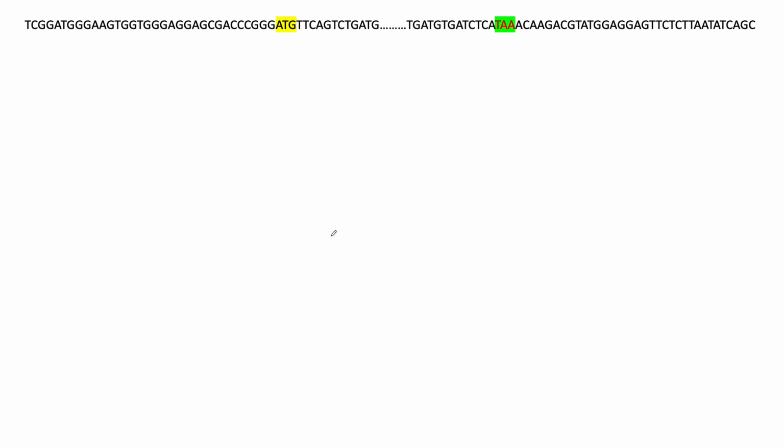So that, as we explained in the prior video, if you need to do your cloning via PCR because you need to add specific restriction sites to your PCR product so that you can create compatible cut sites that match with the vector, then you need the primers to be incorporated into the PCR product. And so I want to show you how that works.